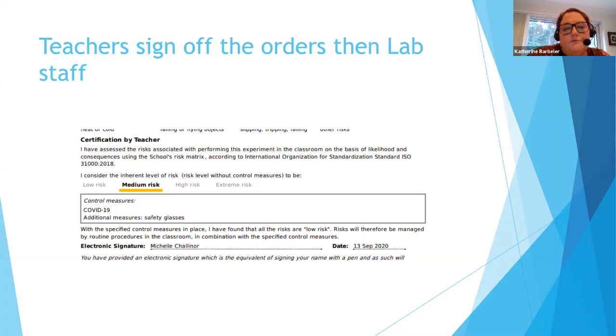All of the chemicals we use in schools have chemical safety codes. So there's different colours, which is how the lab assistants work. There are certain chemicals. For example, I was using one today, hydrogen peroxide. I was with year 12 chemistry students. They're allowed to personally use 3%.